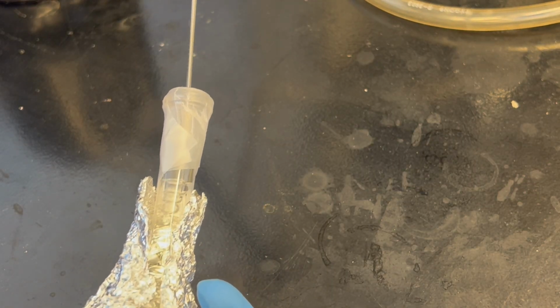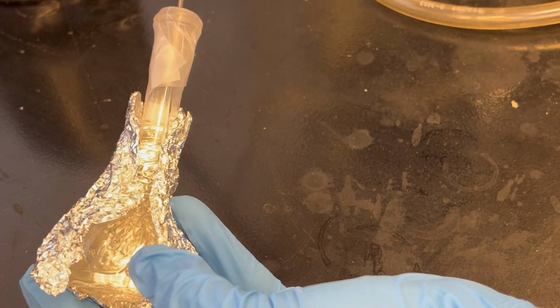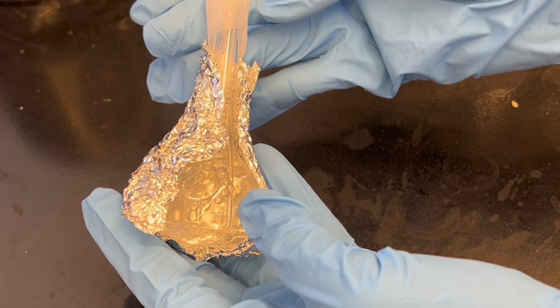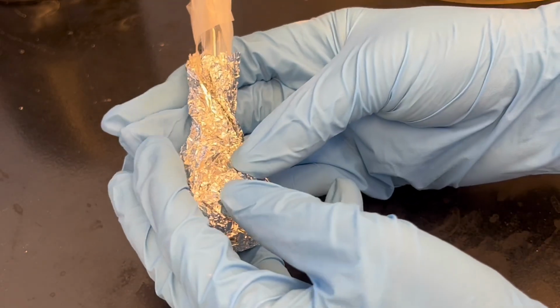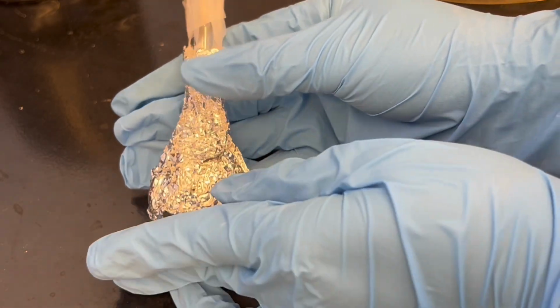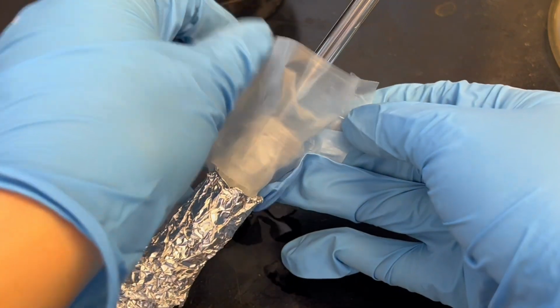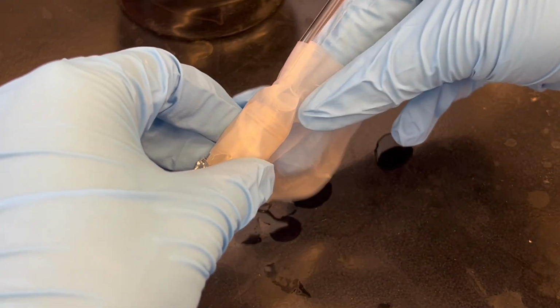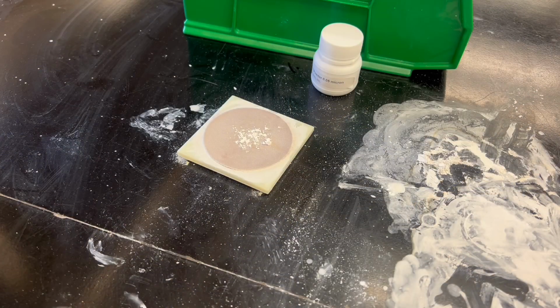This will be way too strong, so I am adjusting it. I'm trying to turn it down. And now we can see this blowing speed is good. And then I will foil it to avoid light contact. And make sure it is foiled very well. And now I will parafilm it very loosely. This step could minimize the contact of the solution with air, because we really don't want it to get oxidized by contact with the air in the environment.